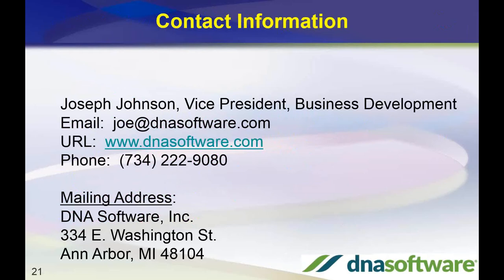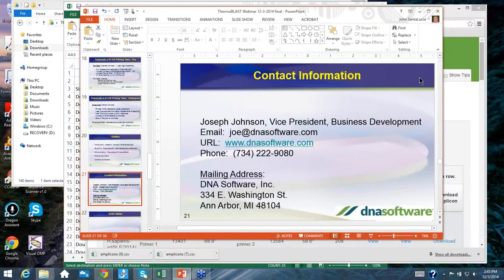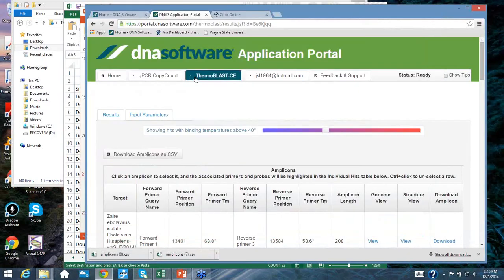The next question is, the default playlist appears to be DNA. How does one enter an RNA playlist? Oh, that's very simple. When we're choosing the sequences, if you give them as GenBank accession numbers, it automatically assigns the sequence type based on whatever GenBank has it set to. But you can change it. That's in the software there. It's probably not so easy for me to get to it from here, but it's very simple to set that. Let's see if I can find it quickly for you.